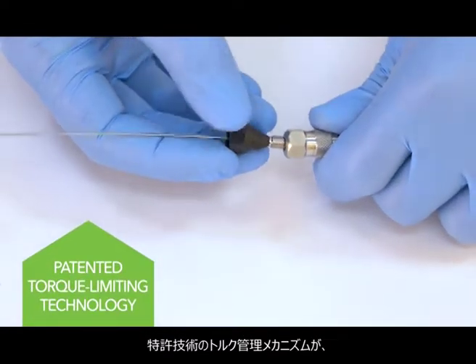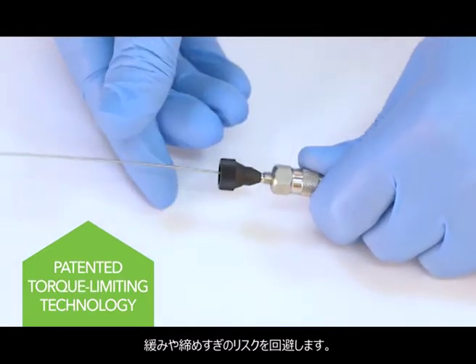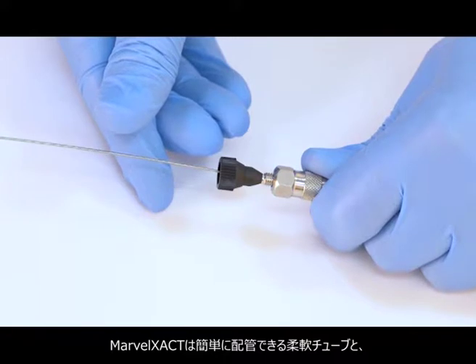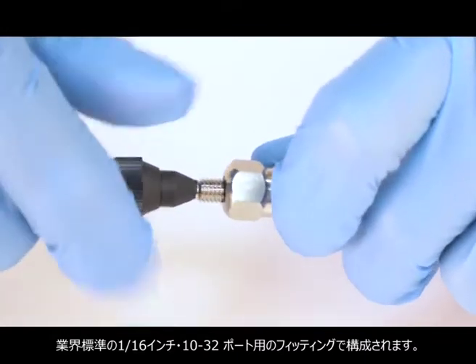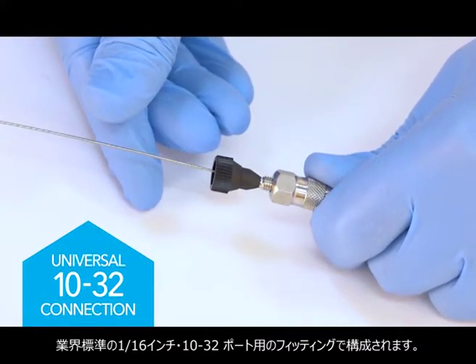With our patented torque-limiting mechanism, the risk of under or over-tightening is eliminated. Marvel Exact is a complete connection system that incorporates flexible tubing to easily route through your system, and two fittings designed for use in industry standard 1/16th inch 10-32 cone ports.